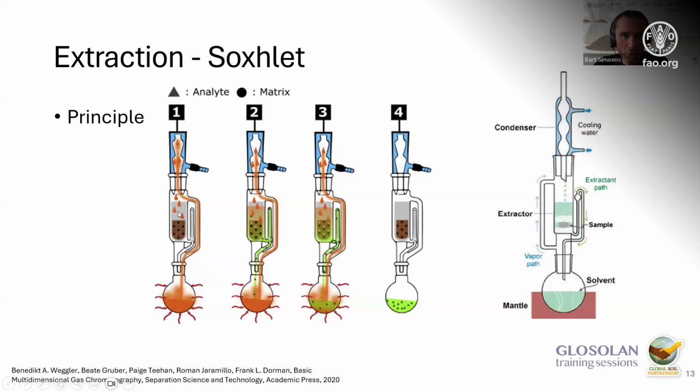The liquid drops fall into the thimble, and the thimble slowly fills. Parallel to the thimble there's also a little system, I don't know exactly how to say it in English, but these two levels of liquid are always at the same height.